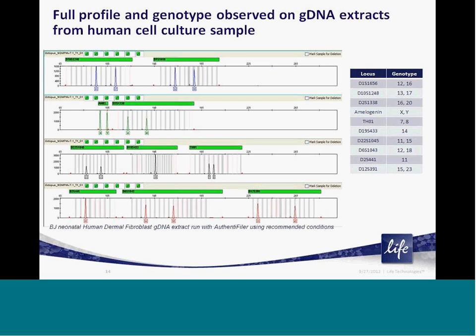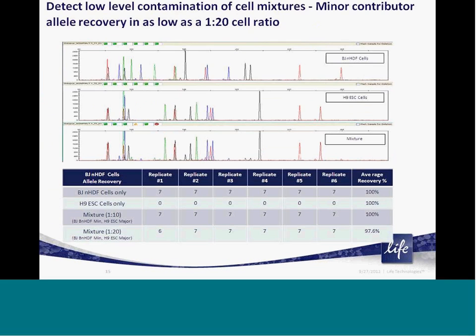Here is a full genetic profile generated from a genomic DNA extract from a neonatal human dermal fibroblast cell that was amplified and resolved using our recommended protocol. Each loci has a genotype consistent with the expected genotype for the cells. In addition, when a low level of H9 embryonic stem cell genomic DNA was added to the sample prior to PCR amplification, the Authentifiler kit is able to generate and capture the alleles from this low-level contributor at both a 1-in-10 and 1-in-20 mixture level. This high level of sensitivity can greatly help researchers when they are looking for low-level cross-contamination in their samples or cell line cultures.